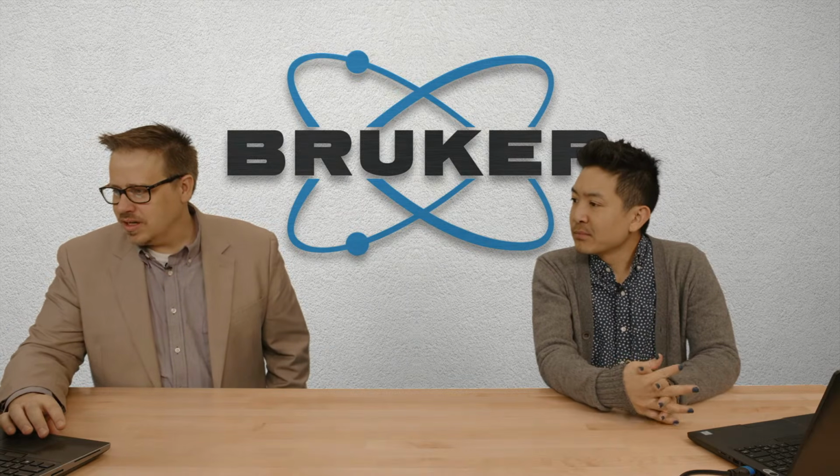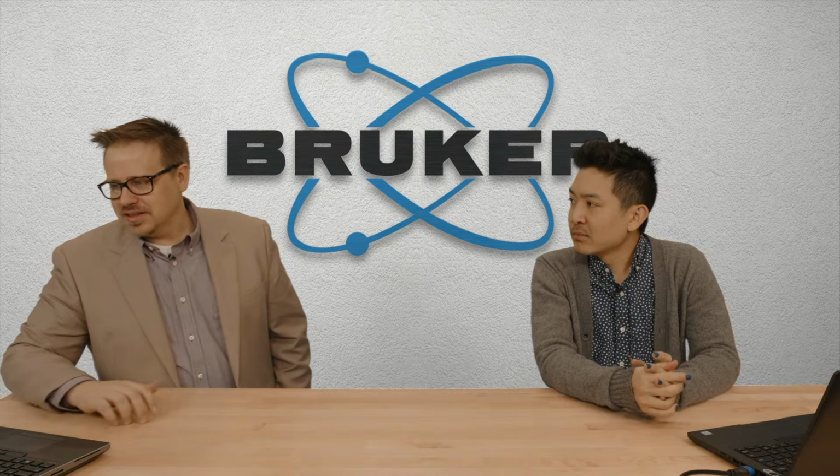All right, next one from AJ. What is a reference pattern for 2D scan? Well, generally speaking, whenever people are looking at a reference pattern for anything, corundum is pretty common. All of our instruments come with a corundum standard, which is aluminum oxide. If you were trying to reference or calibrate your detector position, say for the Eiger, the Eiger can be put at a very close location. It can dynamically go to a very far location.